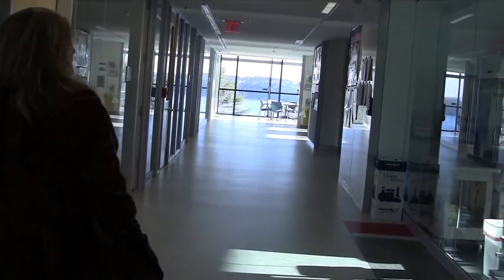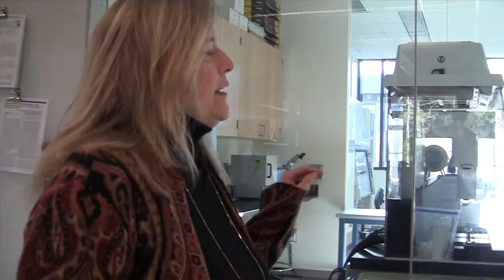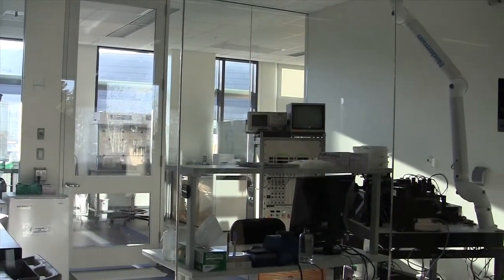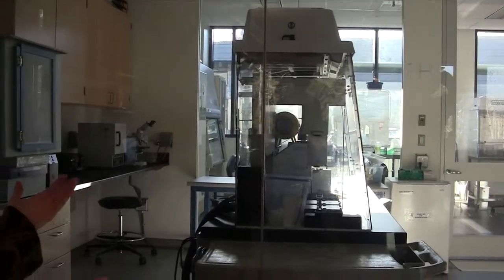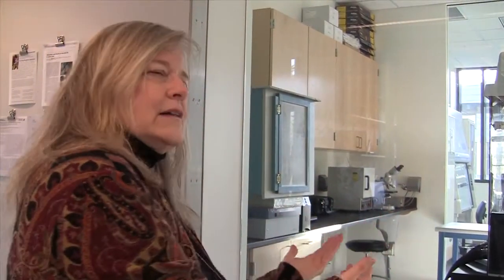This is the best way to see it, I think, at this point, with the sunlight beaming through it. This is the first facility of its kind in the world. This is called the Single Cell Genomics Center, and what is done here is basically bioprospecting. It's looking at inside cells that nobody has ever seen before, because most of the cells in the ocean can't be grown in test tubes or petri dishes. We can grow about 1 to 1.5% of what's out there. The rest just won't culture. We haven't been able to culture it yet. So 98%, say, of the life that's out in the ocean has been unculturable and unavailable for research.